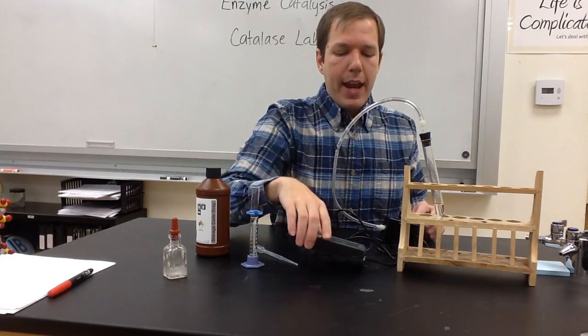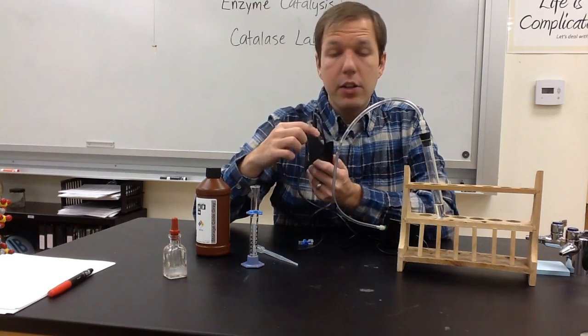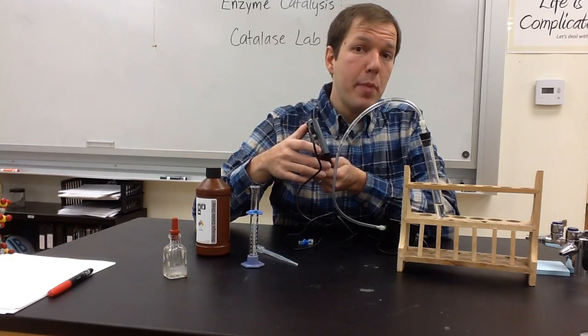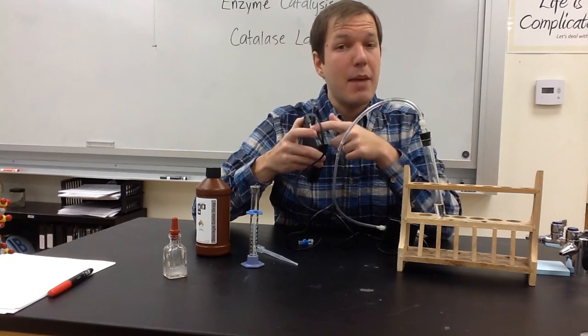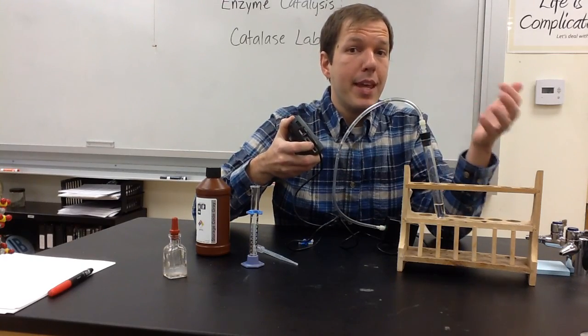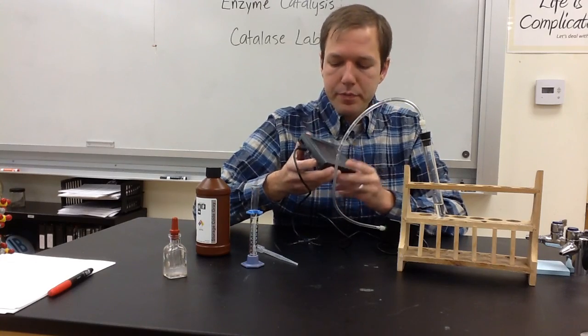Finally, in terms of analyzing data collection and collecting more data, remember that you have 3 channels into which gas pressure sensors can be added. So it may be beneficial to set up several different tubes, making sure that you label them, and collect data simultaneously. It takes a little bit more to set up, but then it saves you a lot of time once that data collection has started.